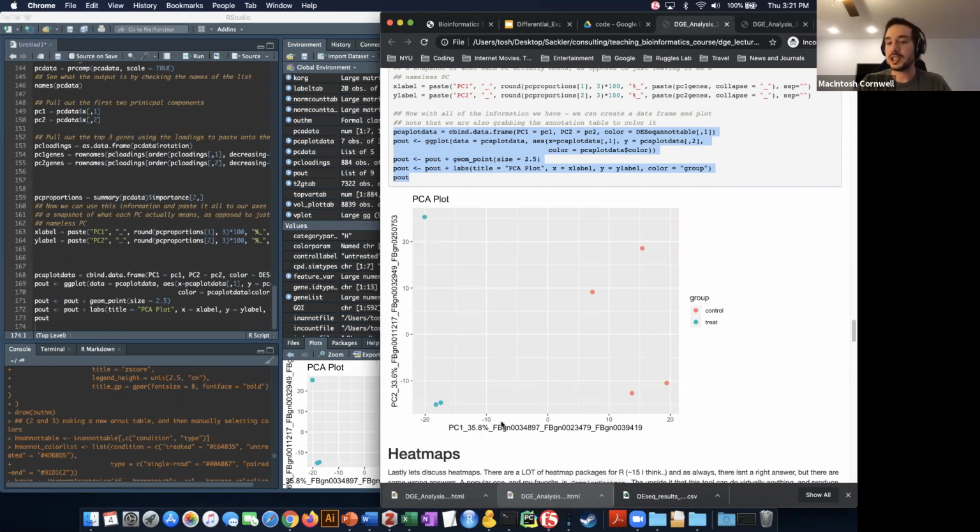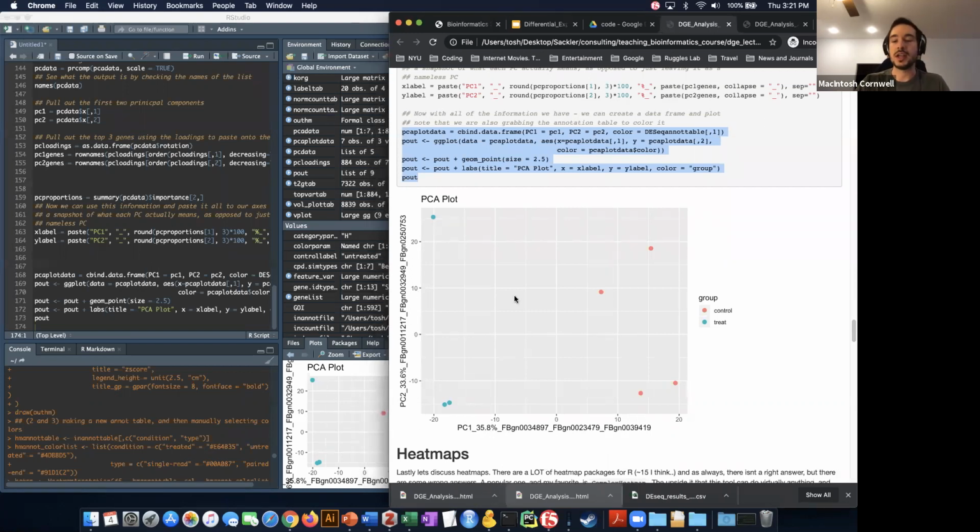And also, these three features are the primary drivers of this variation, just like these three features are the primary drivers of this variation. So in the end, what you have is a nice figure that shows differences between your groups, how much difference can be explained in this one figure, and then the primary features that help drive that separation between your clusters.